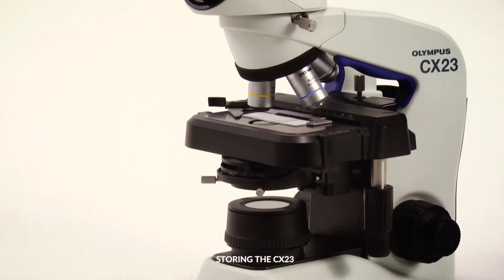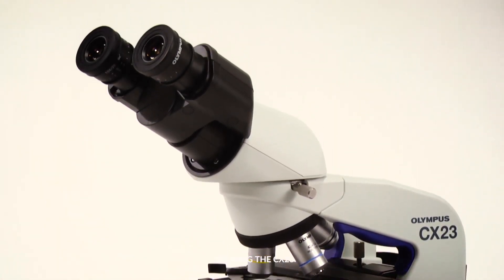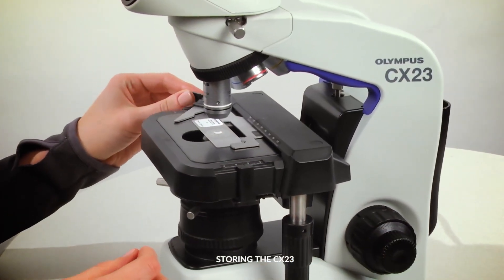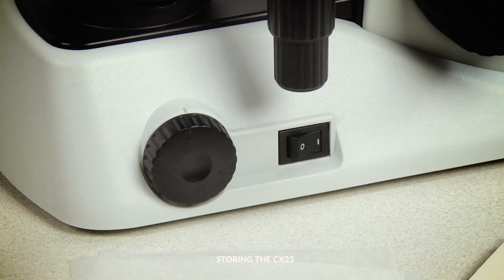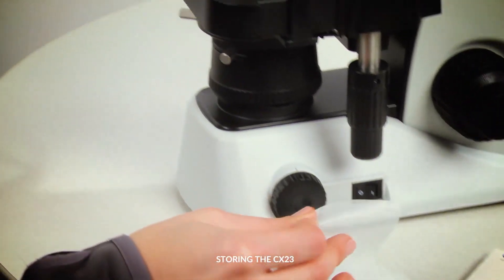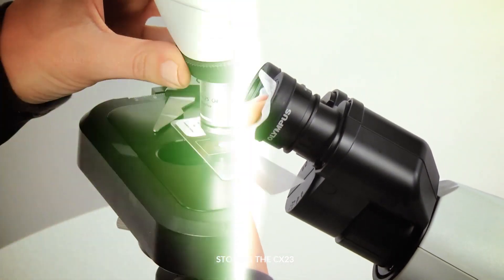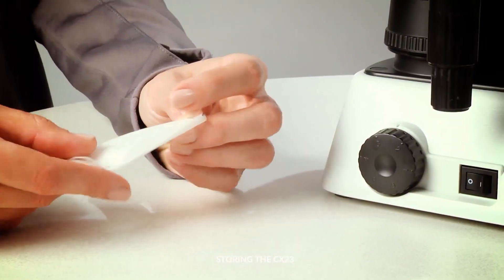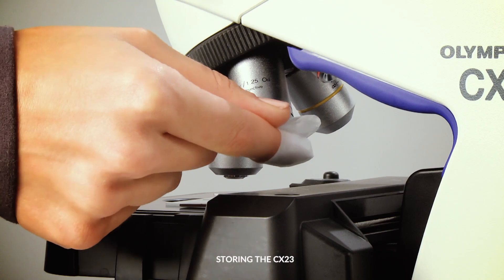When finished with your CX-23 microscope, it is important to properly clean it before storing it away. Start by lowering the stage and remove the slide from the stage clip. Turn off the LED. Clean the objectives and eyepieces with lens paper. If oil was used on the 100X objective, revolve the nose piece to remove the objective from the sample. Then, wrap lens paper around a finger and gently wipe with lens cleaner, drawing a spiral outward from the center.